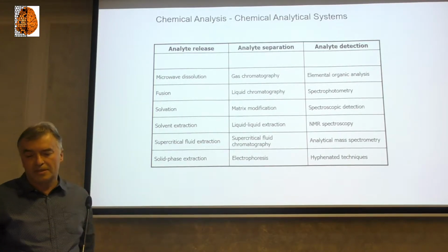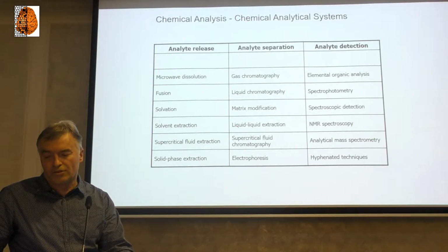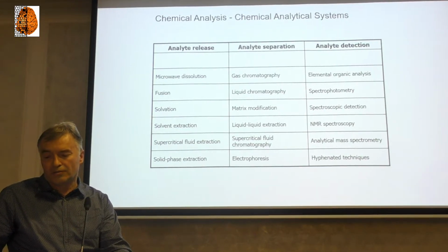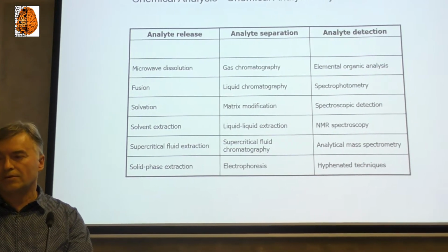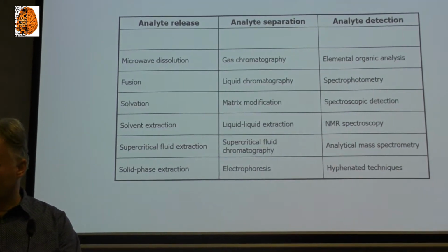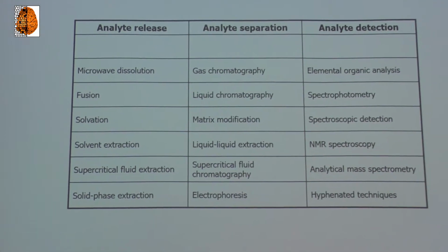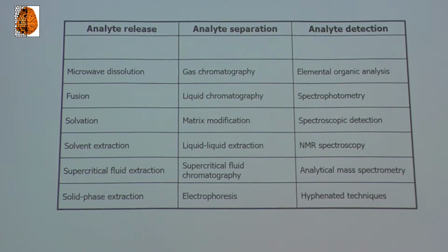The next step is analyte separation, which includes gas chromatography, liquid chromatography, and other techniques which are possible for separation of a mixture of compounds into separated compounds, and finally detection of the analyte, where mostly spectroscopic techniques are included in these measurements.